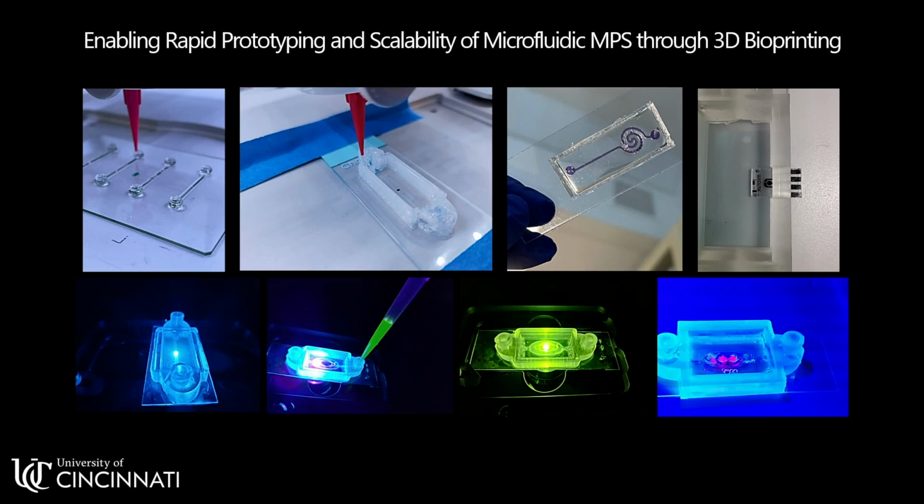And also, we can combine 3D printing technologies and bioprinting technologies to have, I don't know if you see the mouse. Well, to have more complex geometries. Again, making PDMS-free devices that are still perfusable, or even incorporate new readouts, such as electrochemical readouts. This is an example of a scaffold of our device that now incorporates electrochemical sensors.